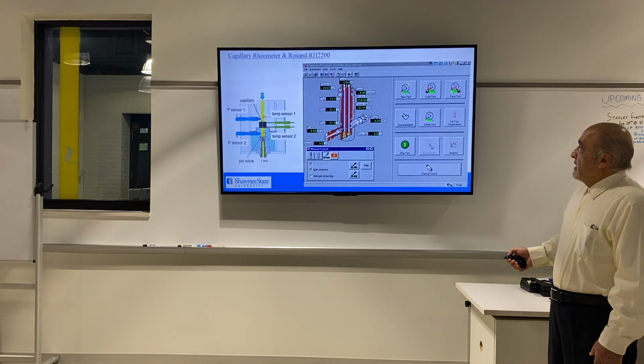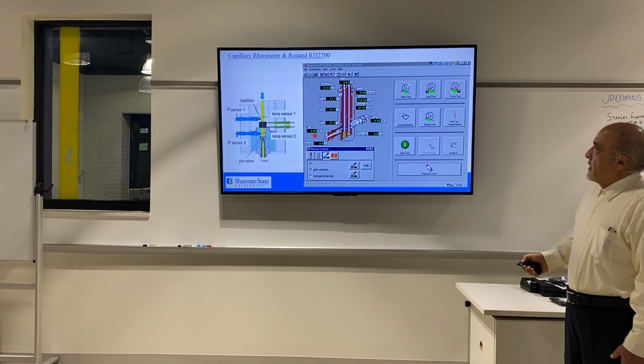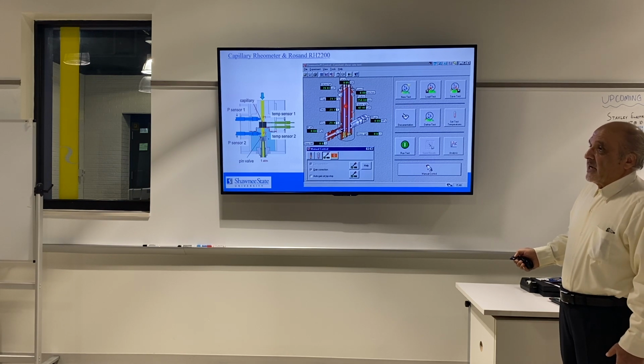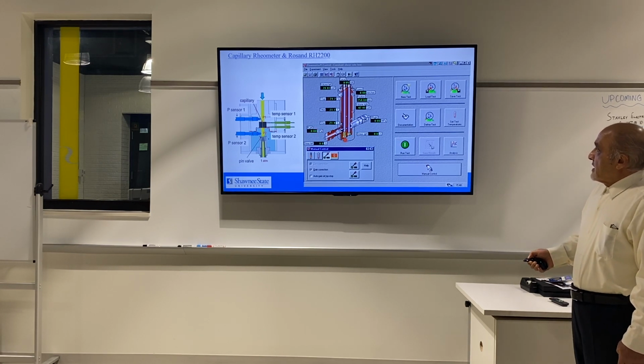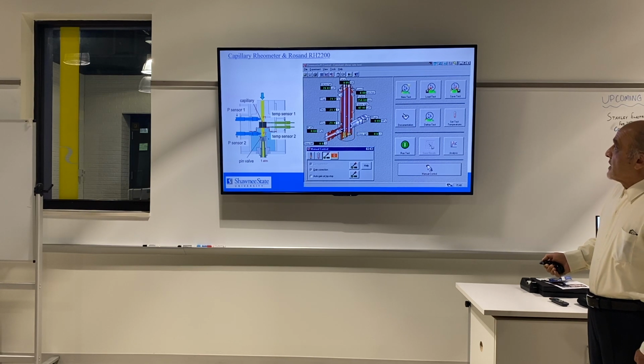The machine that we are using, as some of you already know, has different parts, which you can see, and is based on the software that we will run the test with, like polyethylene and polystyrene at constant temperature, and we measure shear rate and shear stress. So this is the window for the machine that some of you are familiar with.